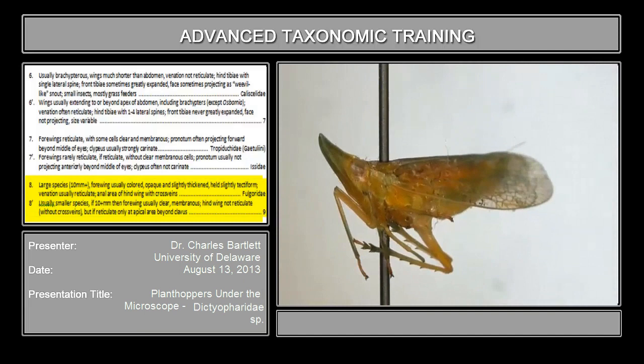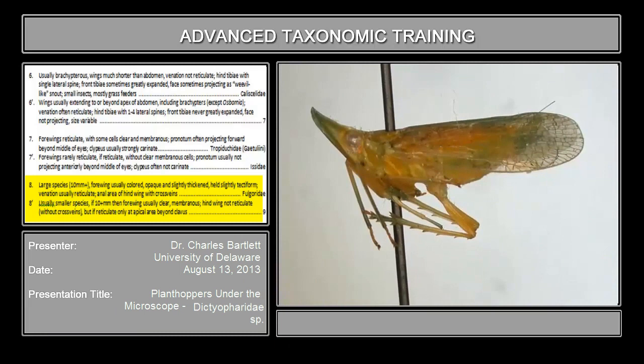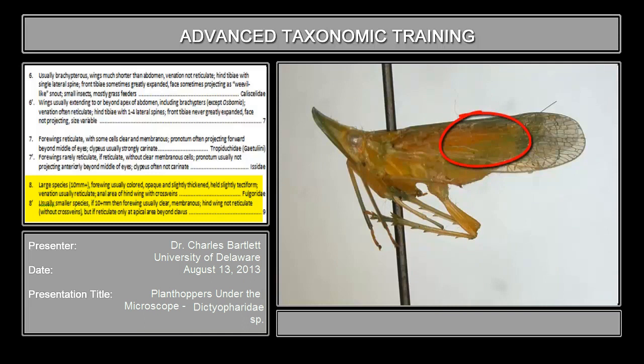Couplet 8 reads 'large species, 10 or so millimeters.' Does this qualify as large? I would say it qualifies as large — 10 millimeters. The forewing is usually colored, membranous, opaque and slightly thickened — that's not the case here. Held slightly tectiform — that's certainly the case. Venation usually reticulate — this is a little tricky, because if you look at the cells at the apex of the forewing, you will see the wing venation is somewhat reticulate.